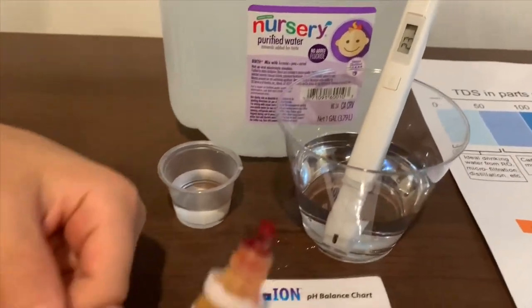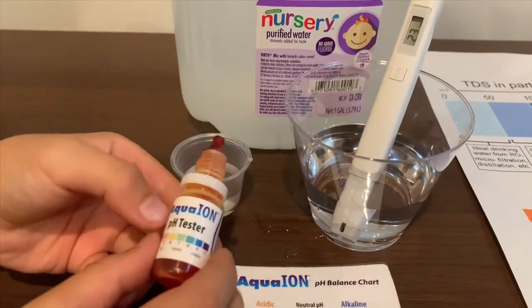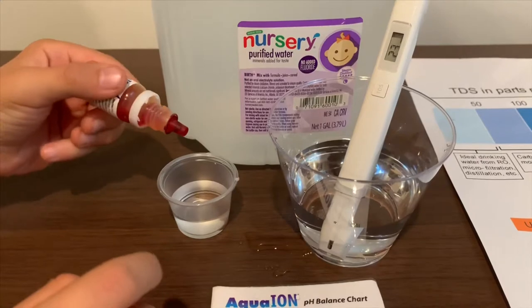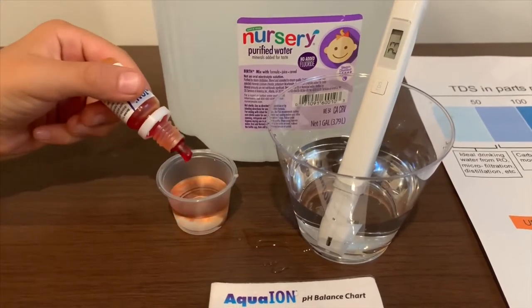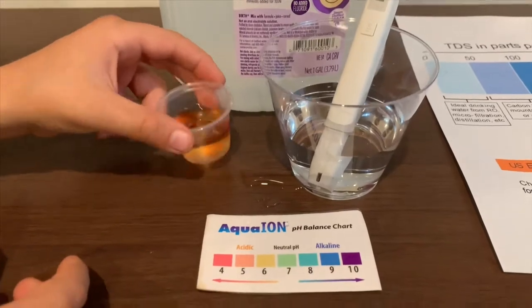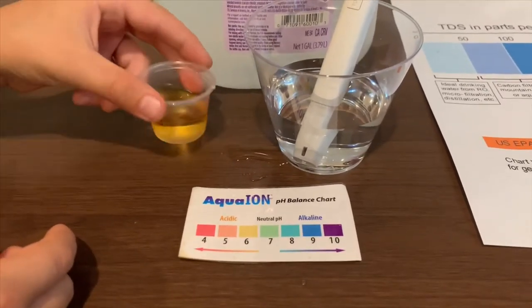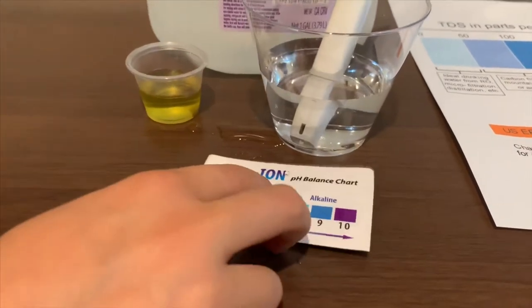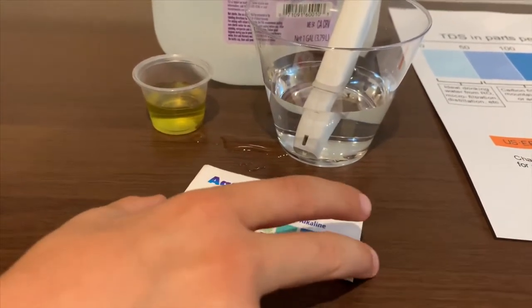Now let's test the pH level. If you want to buy this pH tester, check the link down below. Let me do two drops. Let's stir it a little. I'm going to give this a 7 — it is neutral pH.